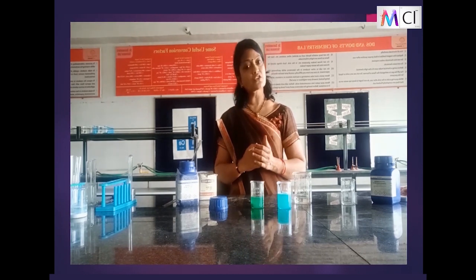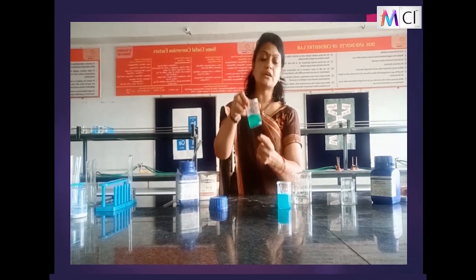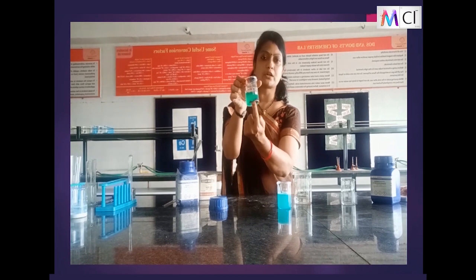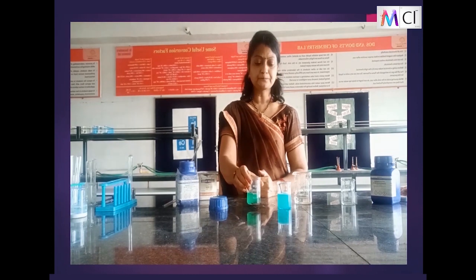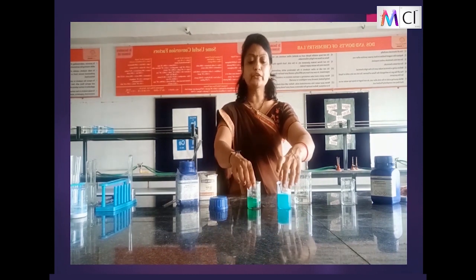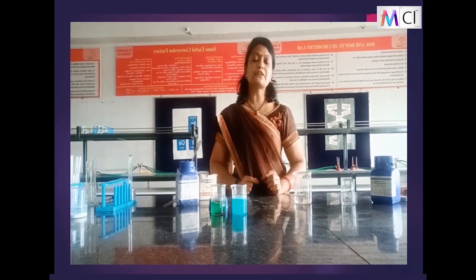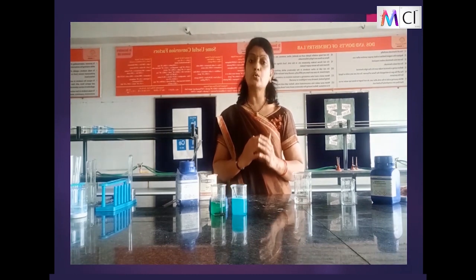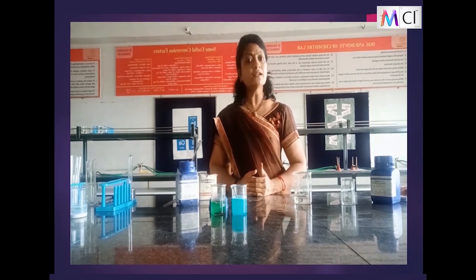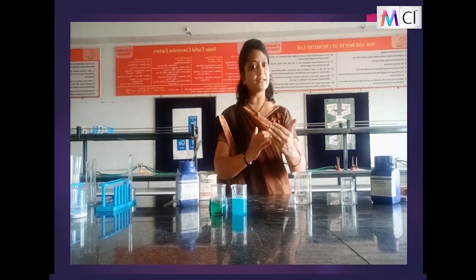So we have a reaction CuSO4 plus Fe giving you FeSO4 plus Cu, that is copper is set free, which we observe as a red color coat at the bottom. This is the copper which is set free and the solution formed is of ferrous sulfate, right? So a beautiful reaction. This iron also will react with the copper sulfate solution and get a coat. We will see. And children, these displacement reactions are little slow reactions, and that is why it is taking little time. So now in this experiment, we concluded that iron metal is more reactive than copper.